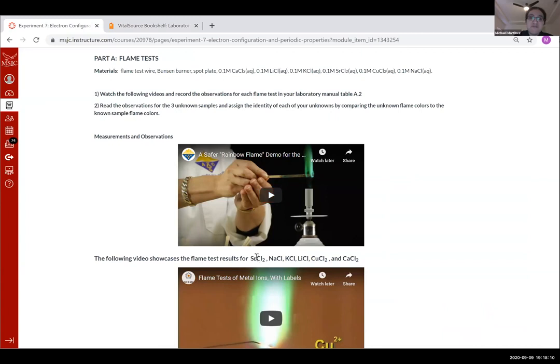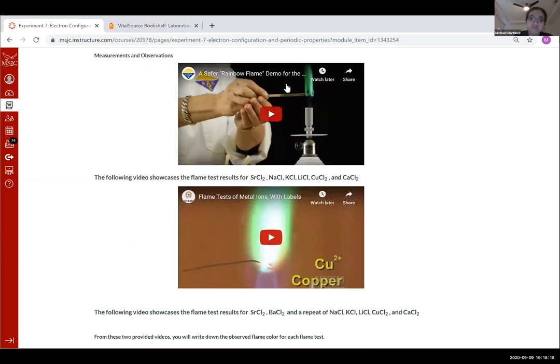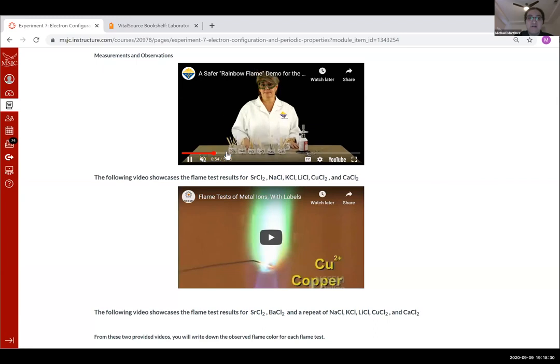Each of these videos showcases the tests for different metals. You're going to need to watch and pay close attention to each of these two videos, as they have flame test results for each of these metal ions. So for example, let's pretend we're watching this video.